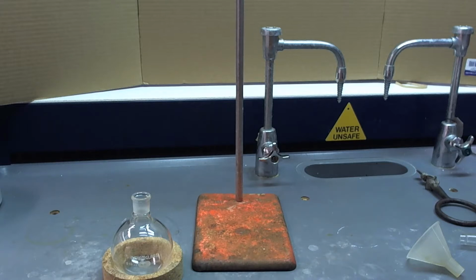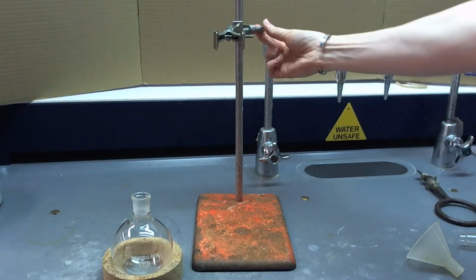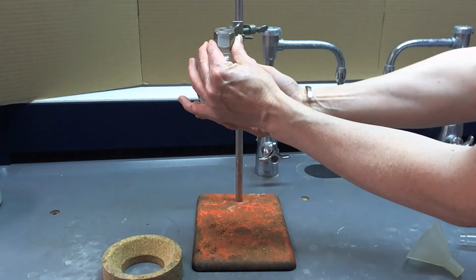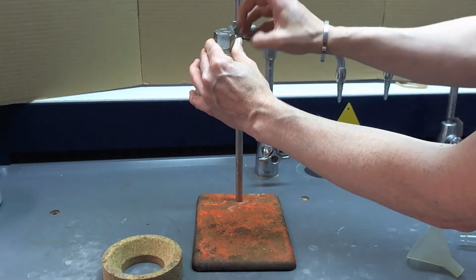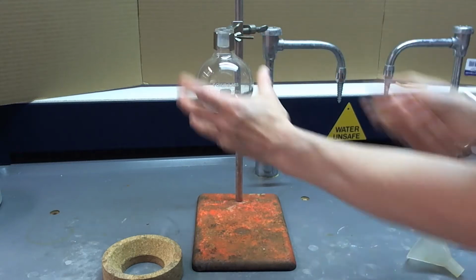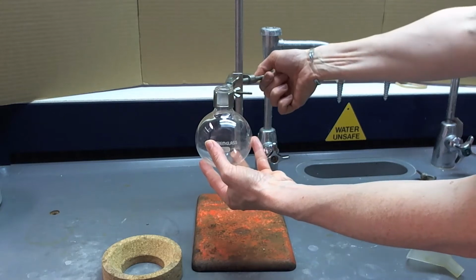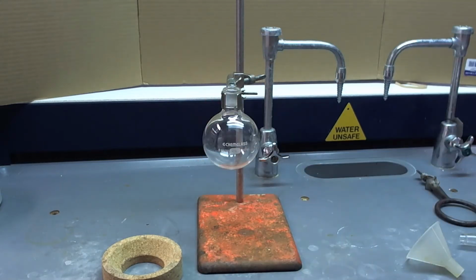So first I'm going to place my clamp, make sure it's kind of tight, and then I'm going to clamp my flask in here. So you can pinch those handles together and then spin that screw really nicely. Okay, if this is firm, we'll be in good shape. I'm just going to bring that down so we can see it a little bit better. So now let's load the flask with the reactants.